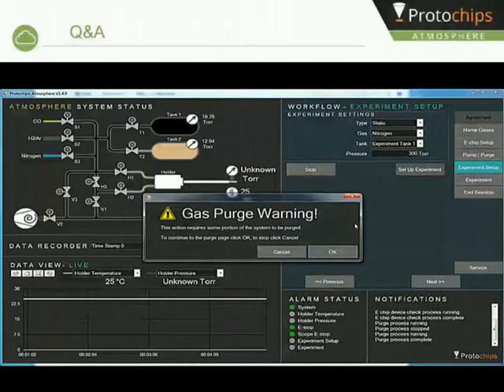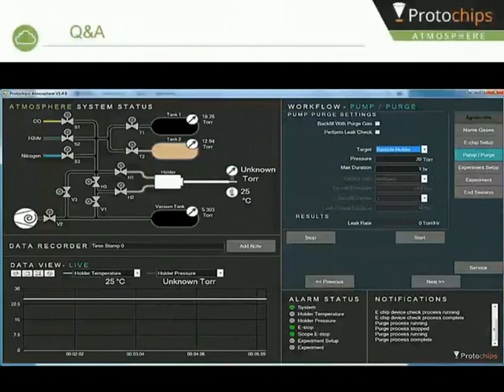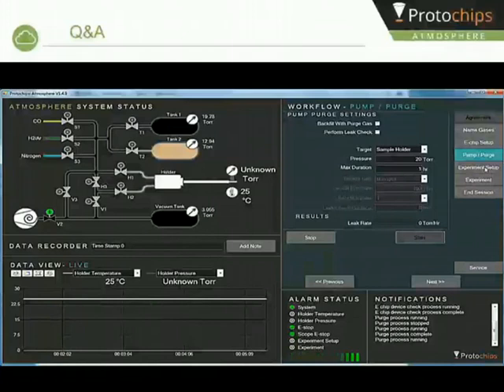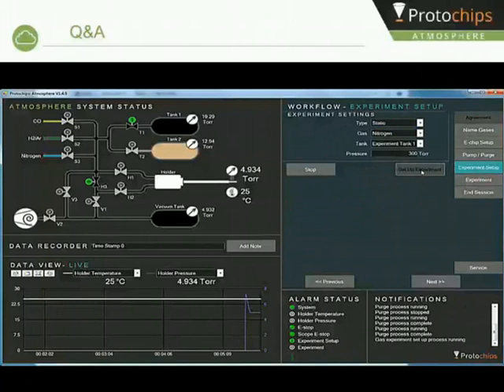Great. Got a question on particle size. What are the advantages of particle size of the palladium and platinum to show high activity? I'm not sure I got the question. Obviously, if a reaction is structure sensitive, particle size is important, and it then affects reactivity. So there are reactions where very small particles are better than large particles, but there are other reactions, like NO oxidation, where the larger particle may be better. So this is really very specific to each reaction, the role of particle size. Here we're just trying to image the actual working catalyst under conditions close to its operation.